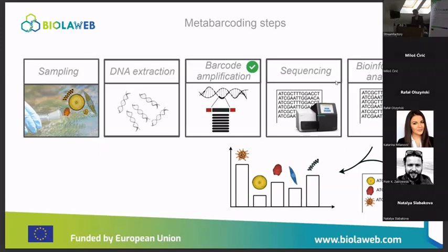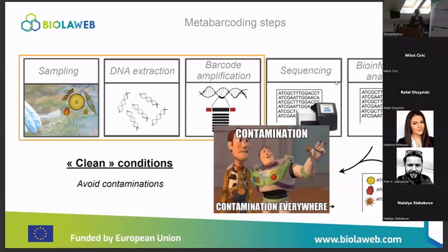The first thing I want to mention is that in a metabarcoding workflow, you are using DNA, and DNA is invisible. At one point you amplify this DNA, so it can be quite sensitive, and you have to be aware of putative contamination. You need to work in clean conditions and make sure DNA from one sample is not mixed with DNA from another sample, because you won't have good results at the end.